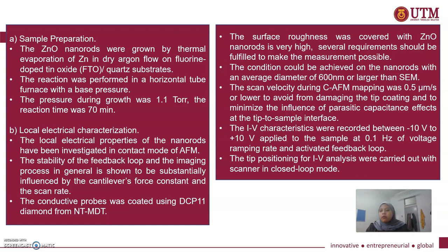The conductive probes were coated using DCP-11 diamond from NT-MDT. The surface roughness of the zinc oxide nanorod-covered sample is very high. Several requirements should be fulfilled to make the measurement possible. The condition could be achieved on nanorods with an average diameter of 600 nanometers or larger, as seen by SEM.